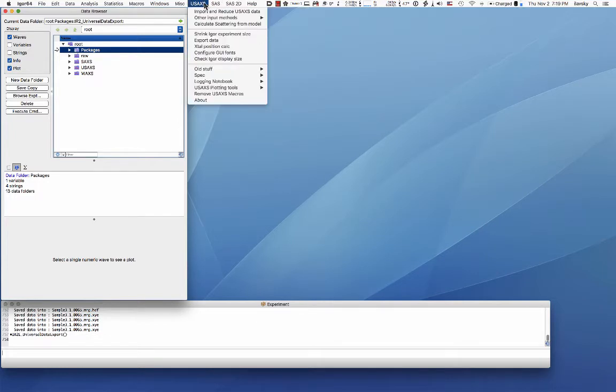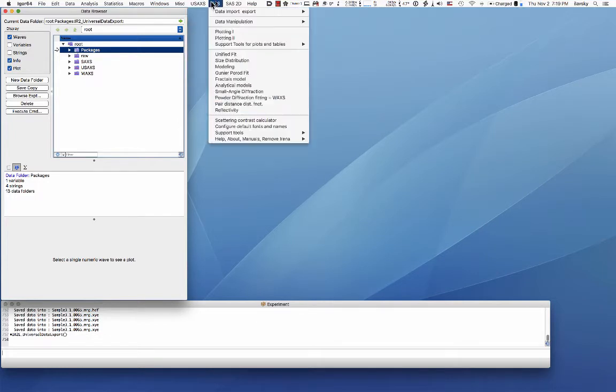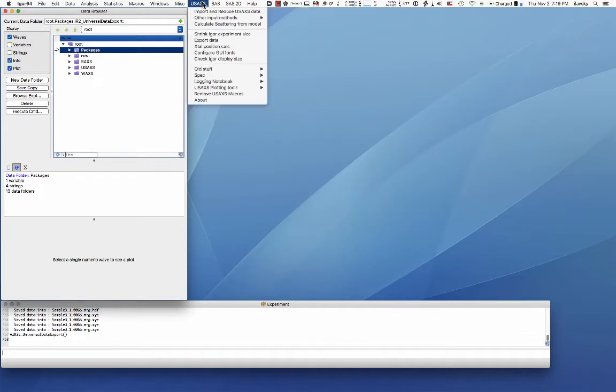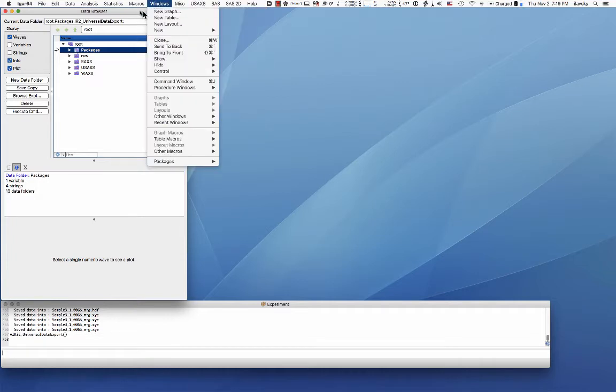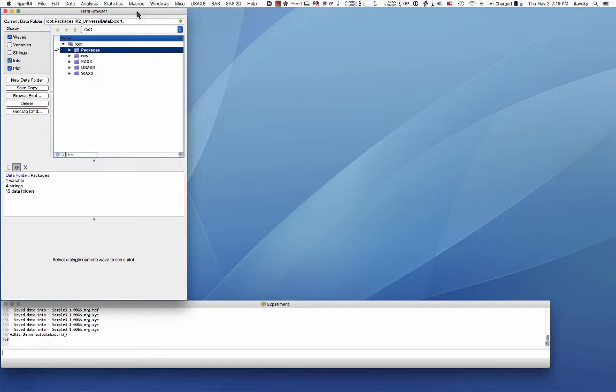So at the end of the day there are data inside Igor Pro which you may want to fit in SASView, SASFit, your own tools which you wrote, or even Excel. I have seen people using Excel. So there's a lot of options which you may want to do. How do you get the data out easily?